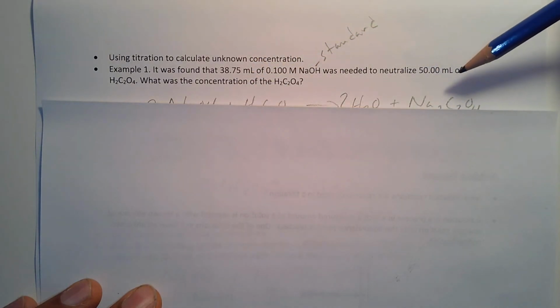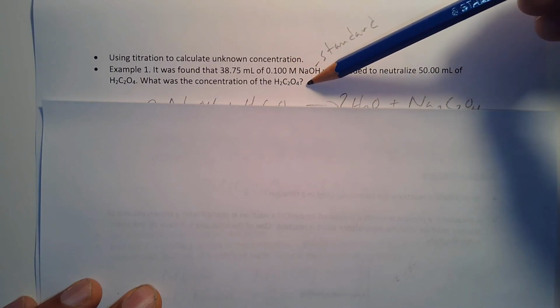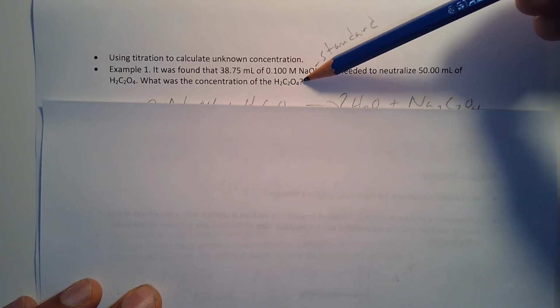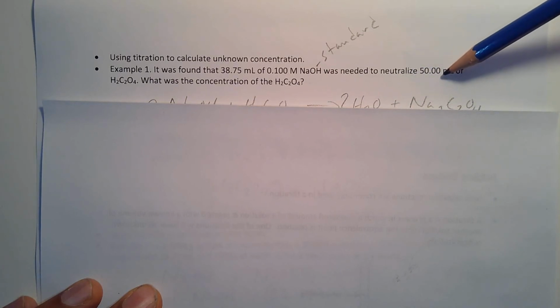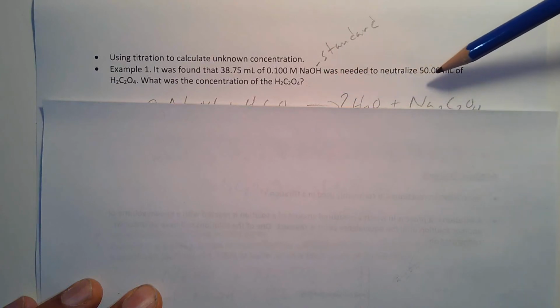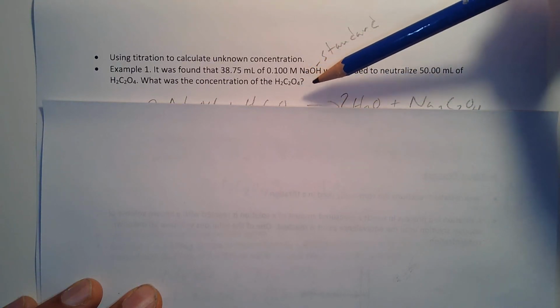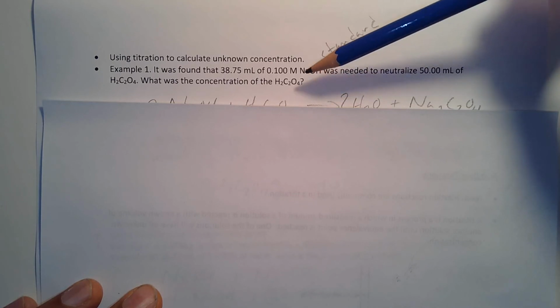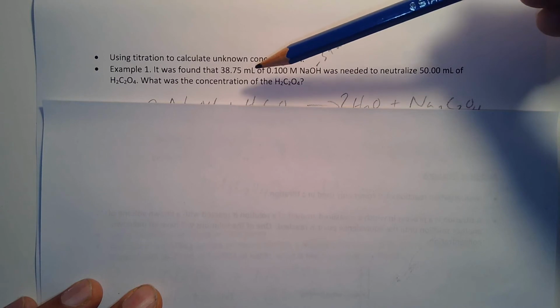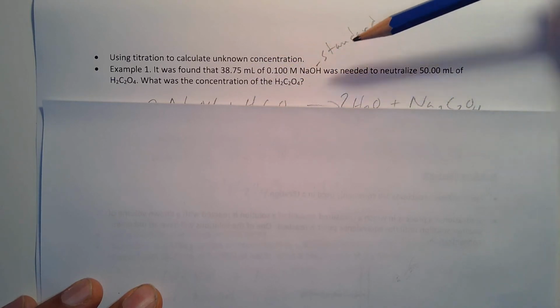And then here's your unknown concentration. We don't know what the concentration of H2C2O4 is, but we have the measured volume. So this would be what's in your flask. You'd have 50 mils of this in the flask, plus some drops of indicator. And what you would find out is that you need to empty out 38.75 mils from the burette into the flask so that you get a permanent color change.